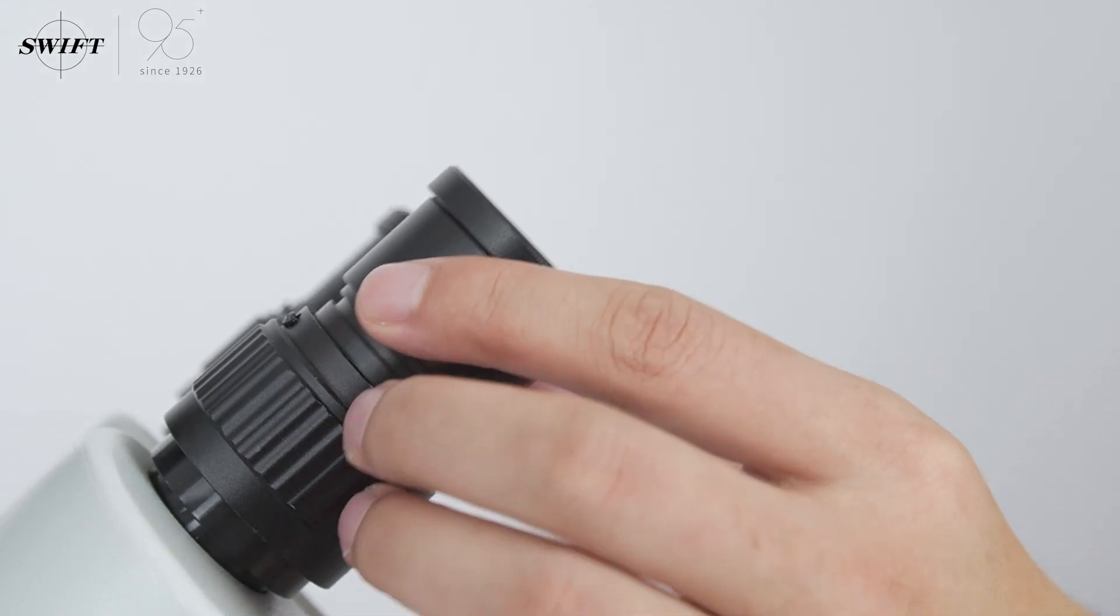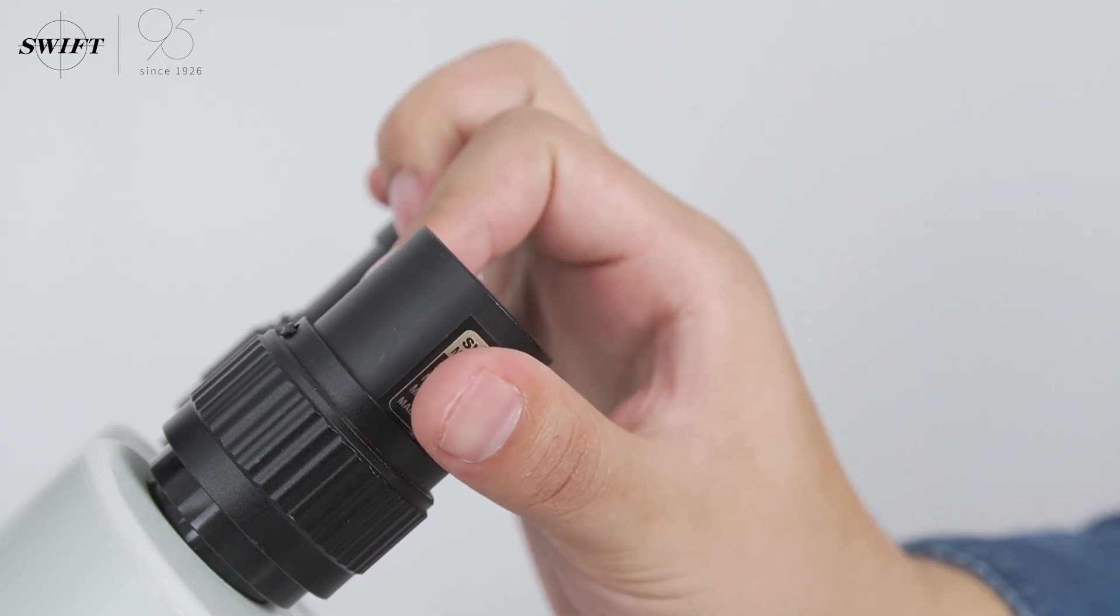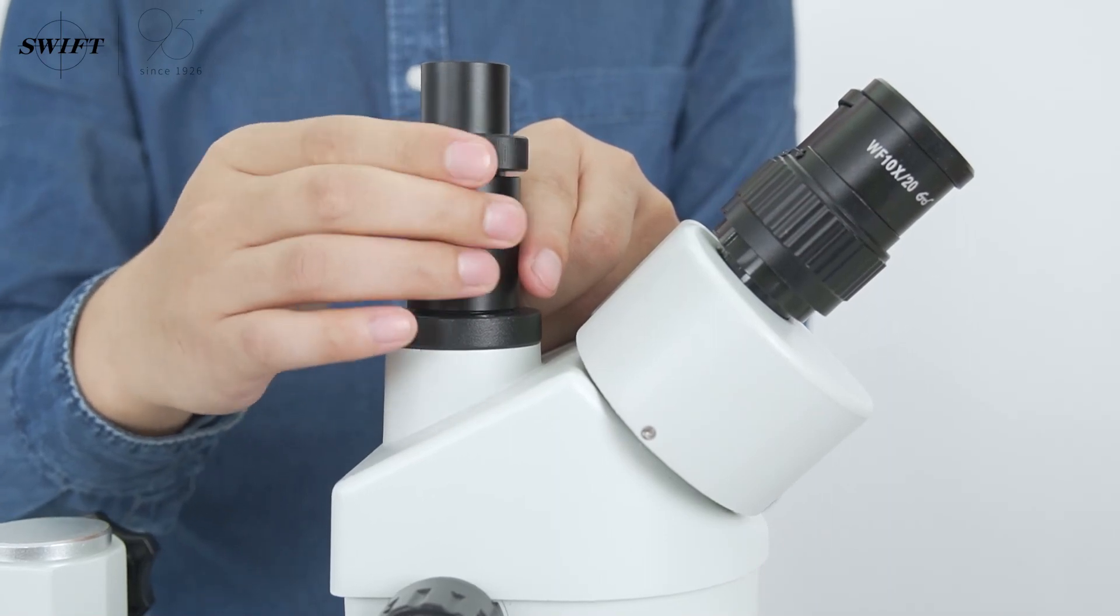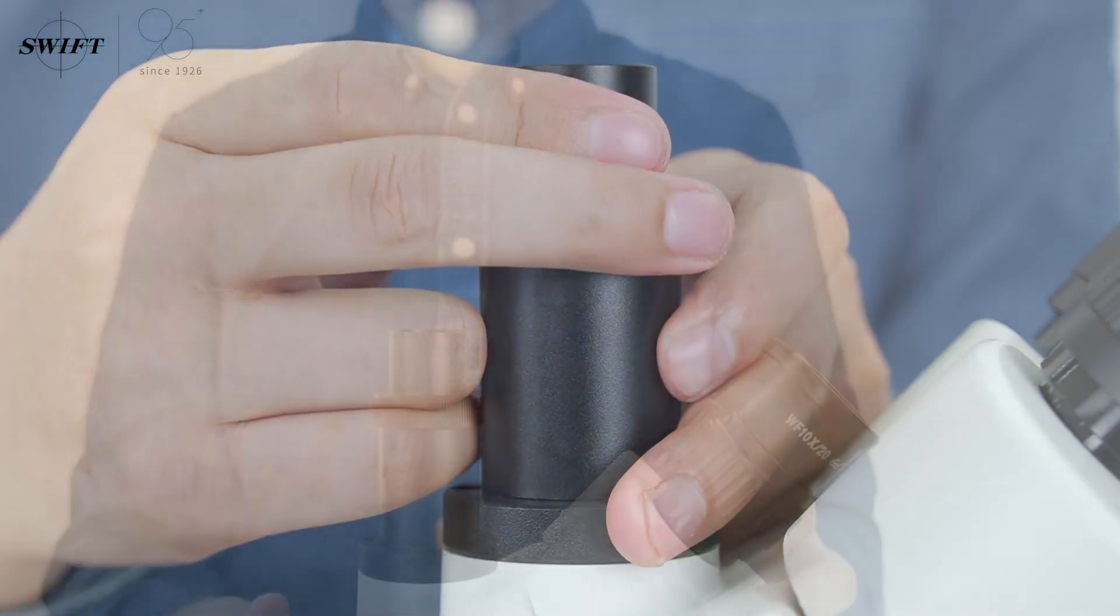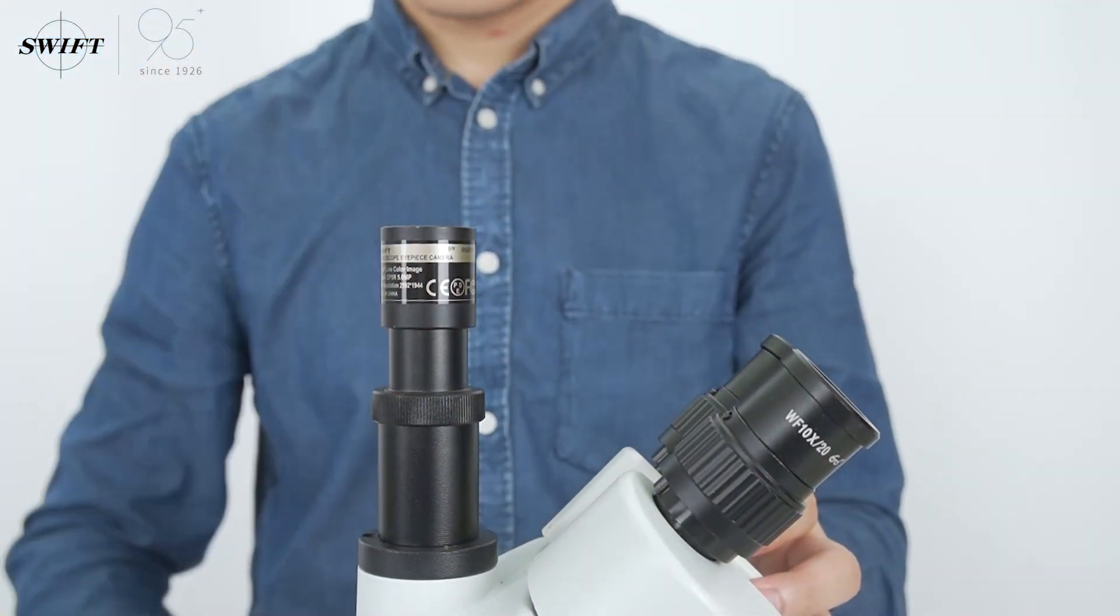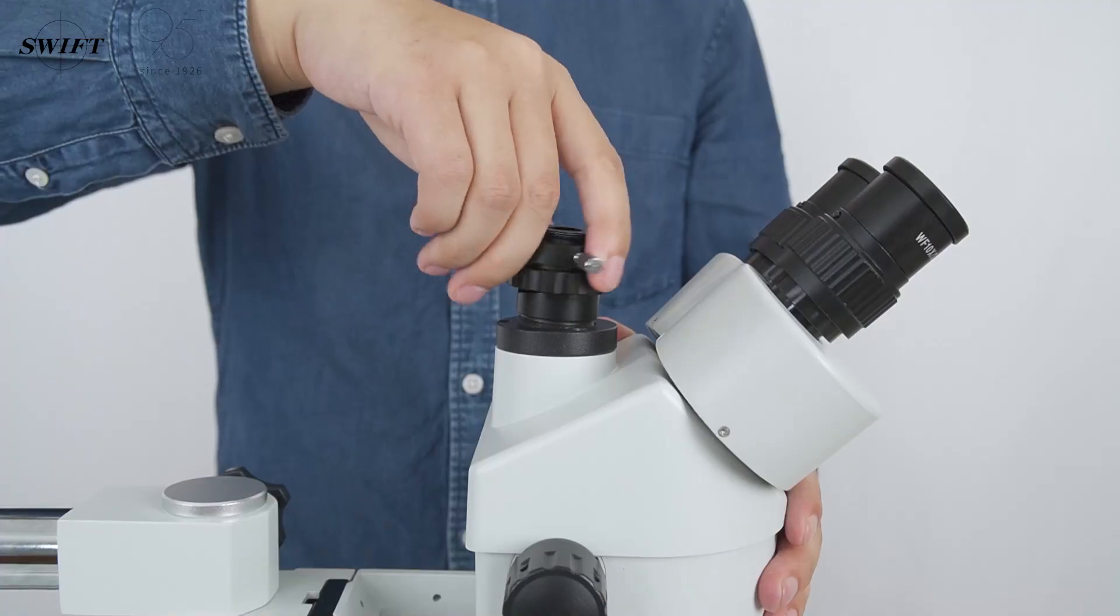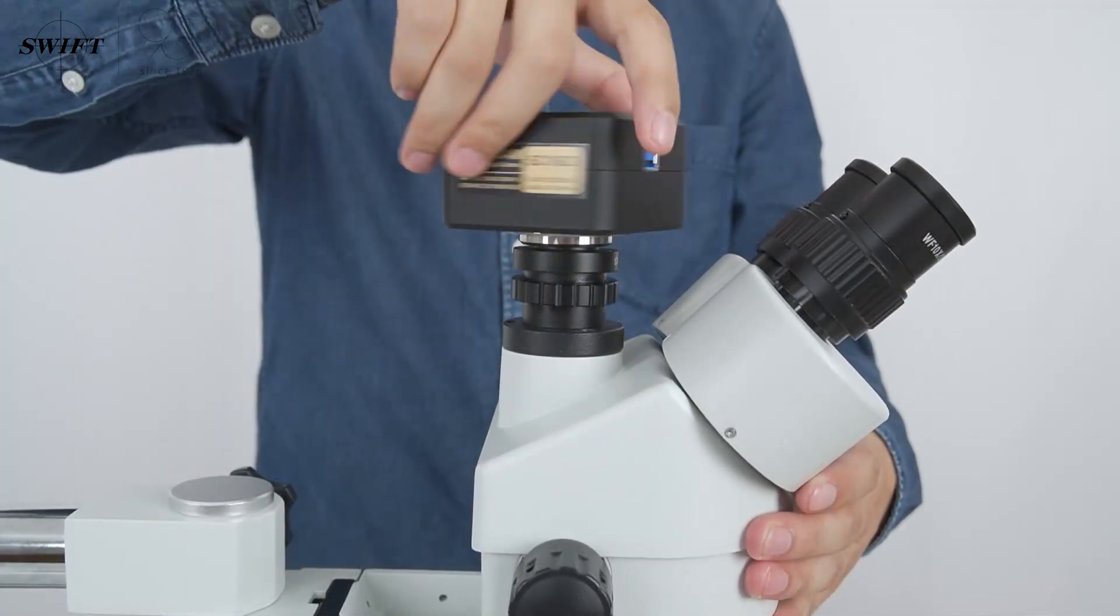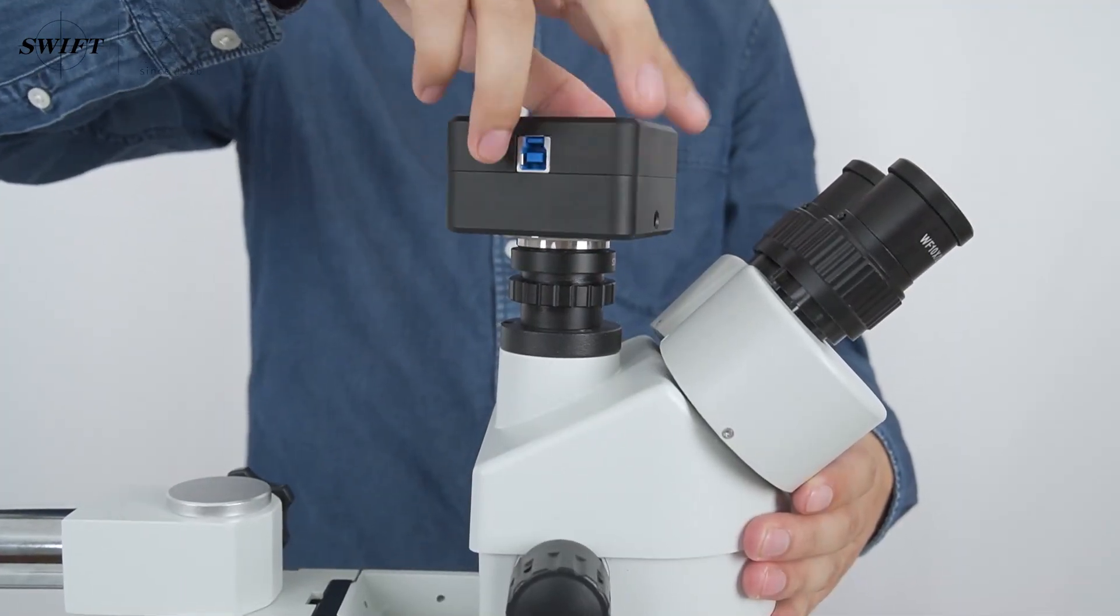First, take out the observation eyepiece and insert the electronic eyepiece, then connect the data cable. Use the trinocular interface to connect the electronic eyepiece and install the connecting ring. Finally, install the digital camera and adjust the connecting ring to make the images observed by the camera and eyepieces parfocal.